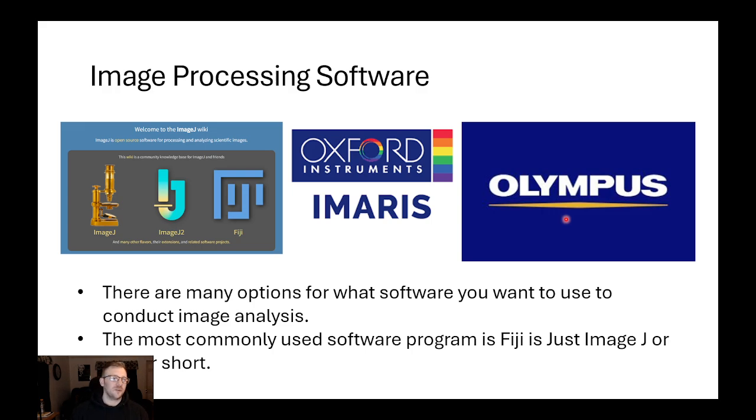All right, so now to interpret this digital image that we've created. We've made a grayscale image. So now we need some way to actually process and conduct our analysis. There's a lot of ways to do this. Basically, every company that makes a camera also makes an image processing software. I put 3 of the big ones up here, but your favorite choice is what you can use.